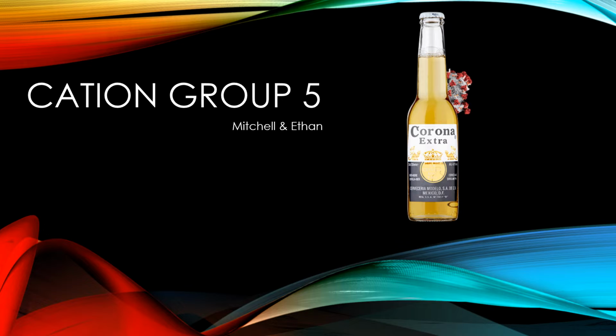And we're here today to talk about water, but not just water analysis, and specifically cation group 5.